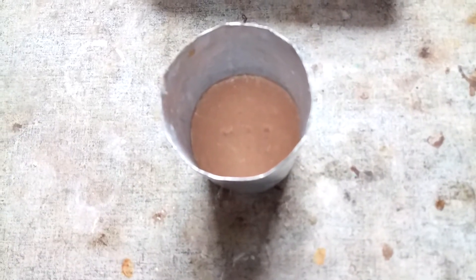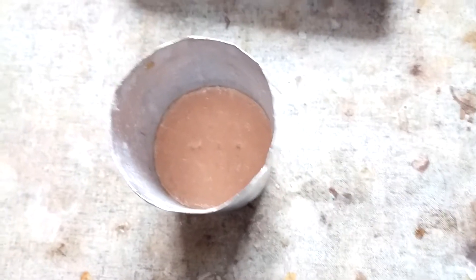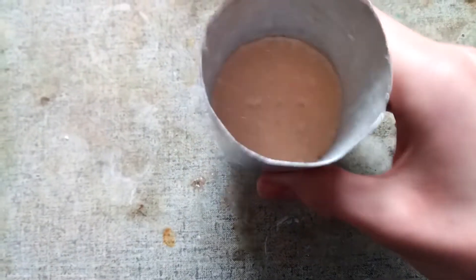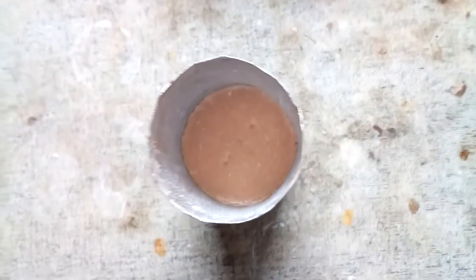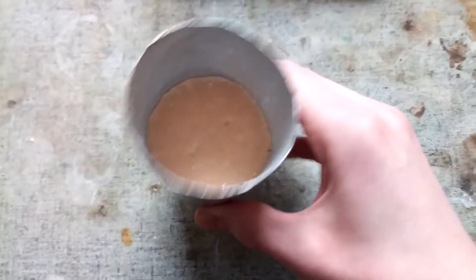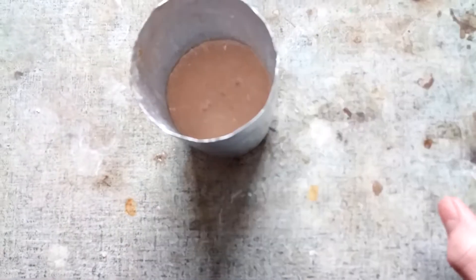I've heated it for a bit over four hours, which is probably a bit more than I would have needed. It's cooled off and it's one solid block — it doesn't come out, so I'm probably going to have to melt it out. It looks pink on camera but it's actually a lot more brown, and hopefully this now has a lot of biuret in it.